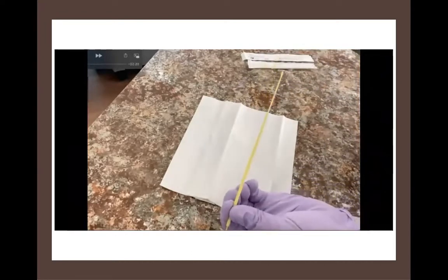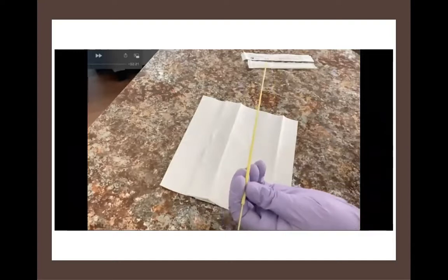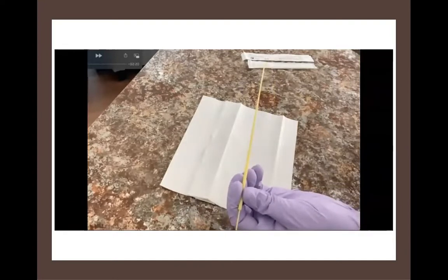Now, some people don't like these single-use inoculating loops. They are not nearly as flexible as a wire loop. And obviously, they're a single-use plastic item. So you can imagine that when they're being used in a busy microbiology lab, hundreds of them are being used every day and discarded into the landfill. So some people are opposed to their use.